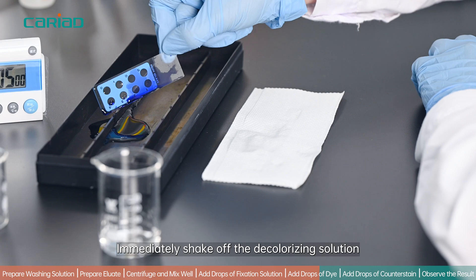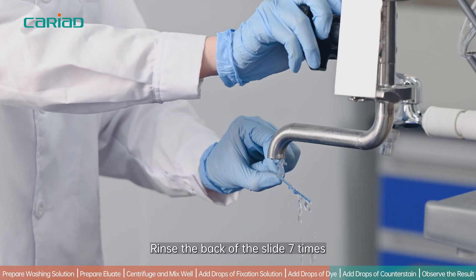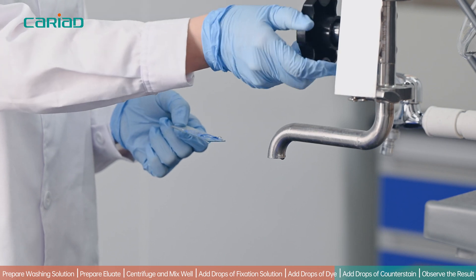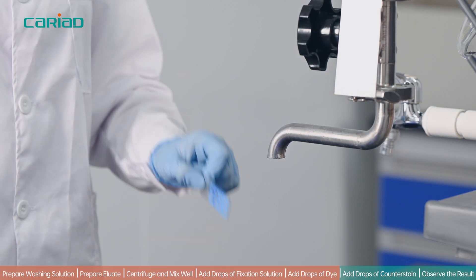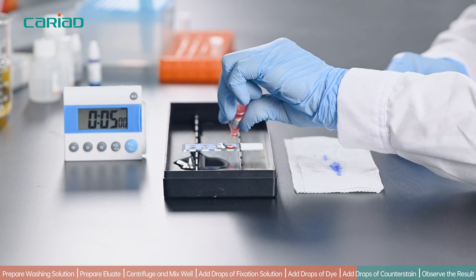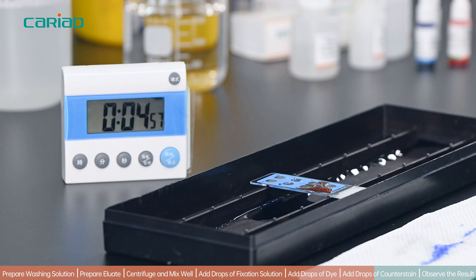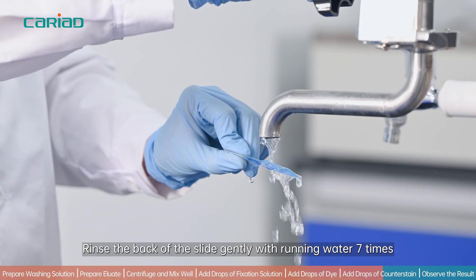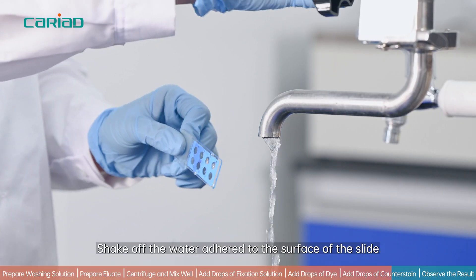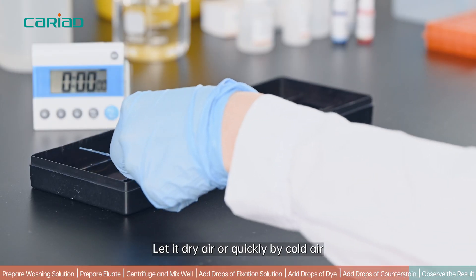Immediately shake off the decolorizing solution. Rinse the back of the slide 7 times. Add 2 to 4 drops of counterstain in the smearing area and stain for 5 minutes at room temperature. Rinse the back of the slide gently with running water 7 times. Shake off the water adhered to the surface of the slide and let it air dry or dry quickly with cold air.